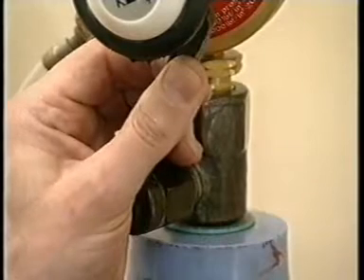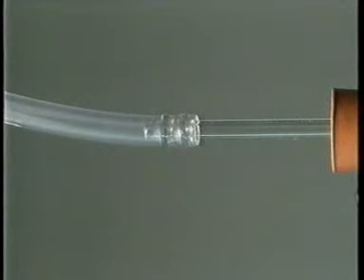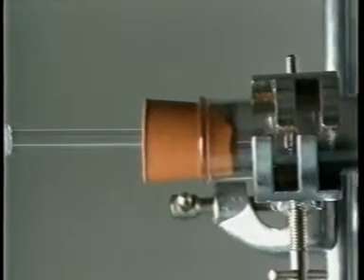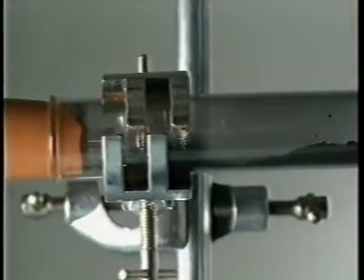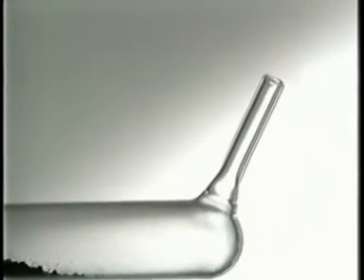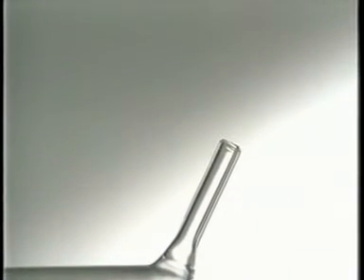Hydrogen gas from a cylinder is passed over the copper oxide. A mixture of hydrogen and air is explosive, but once all the air has been pushed out of the tube, it's safe to burn off the excess hydrogen. It burns so cleanly that it's hard to see the flame.